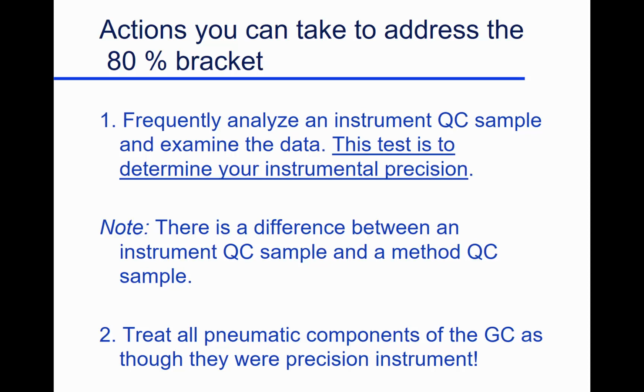There is another thing that I haven't mentioned here that is extremely important too: you can operate a gas chromatograph as a black box. By that I mean you put a sample in and you get a number out, without any thinking in between those two processes. And every one of my students, when they run the gas chromatograph, they actually go to the chromatogram, and you look at it and say, what did the instrument do?